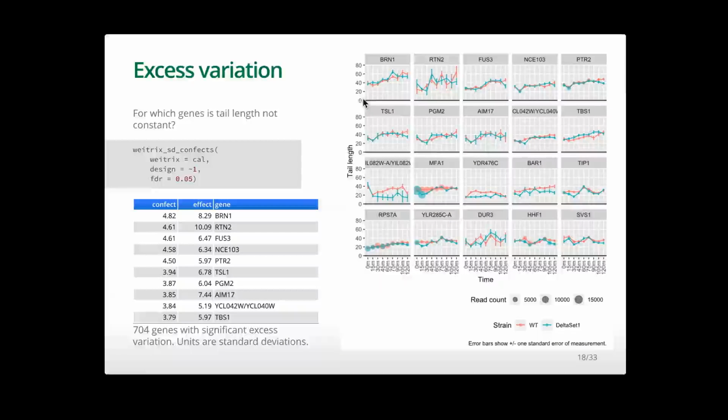You can see it picks up lots of genes changing over time, a few with differences between strains. If you go far enough down, you even start to see a bit of these two cell cycles that went on. The cell cycles are really obvious in terms of gene expression.